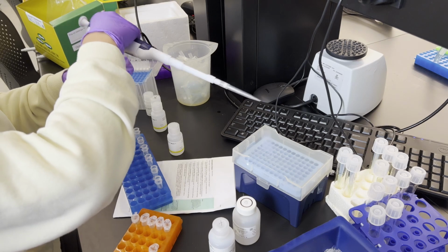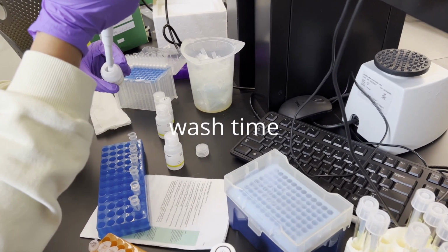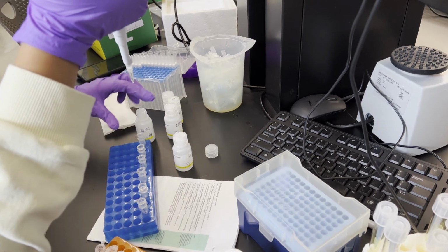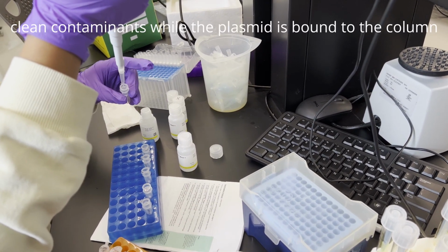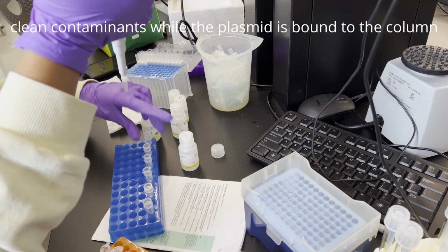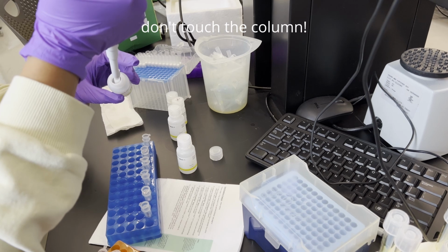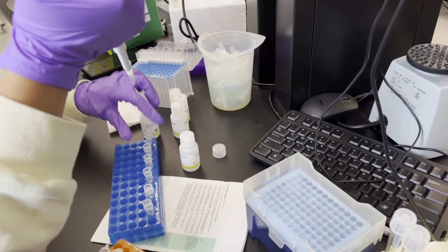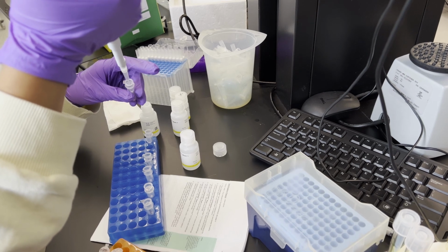Now that we have the plasmid DNA in the supernatant, it is time to wash it to clean other contaminants that were in the solution, like salts. For wash 1 and wash 2, we are introducing solutions to clean contaminants while our plasmid is bound to the column. Make sure to not touch the column with the pipette because you might scratch or remove the plasmid. Also, make sure to read the instructions on your reagents before use and add ethanol or other solutions as instructed.